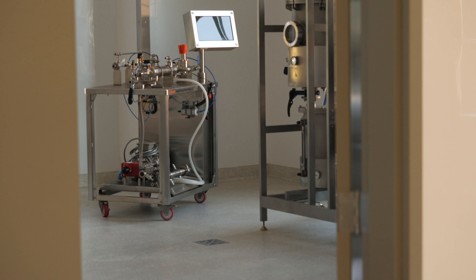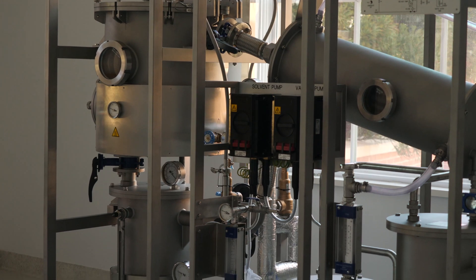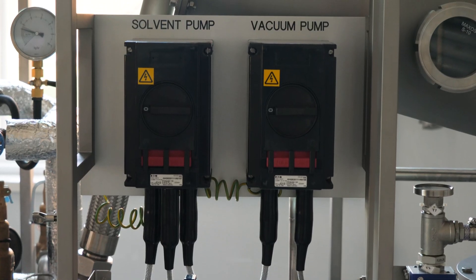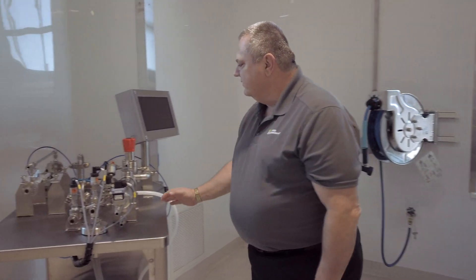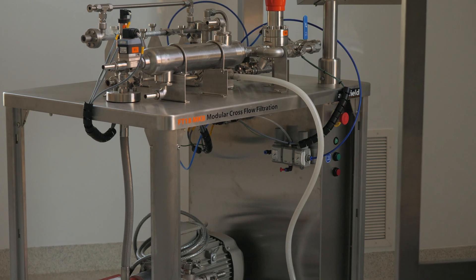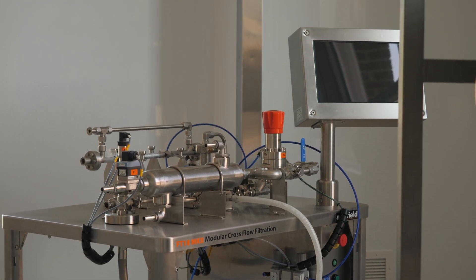We're entering the extraction room of the Food Innovation Lab. Equipped in this facility we have the Armfield FT-29 solvent extraction unit, which is capable of using solvents like ethanol, methanol, chloroform, and hexane to extract natural colors, natural flavors, and bioactives. Also in this room we have a cross-flow membrane filtration unit capable of doing ultrafiltration, diafiltration, microfiltration, and reverse osmosis in a number of different configurations. This also allows us to isolate individual proteins as well as bioactive components.